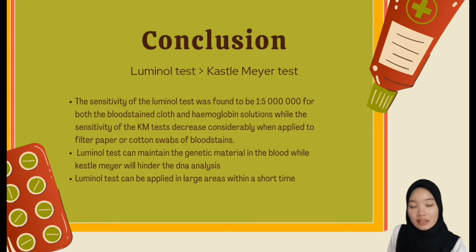Furthermore, luminol tests can maintain genetic material in the blood, while Kastle-Meyer will hinder the DNA analysis due to the strong chemical reaction. And therefore, the luminol test is by far the most sensitive technique and easy to perform, particularly when application over a large area is required.